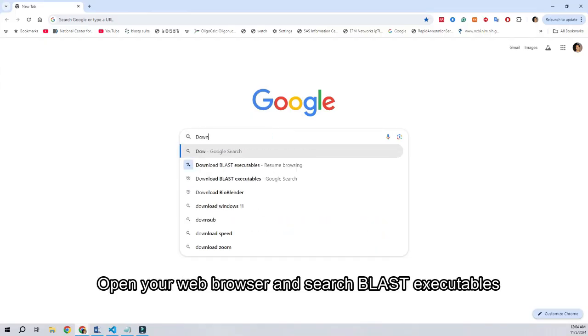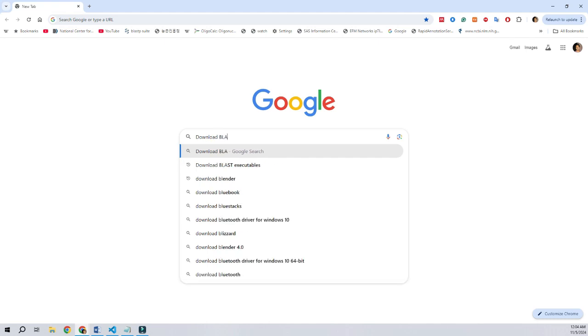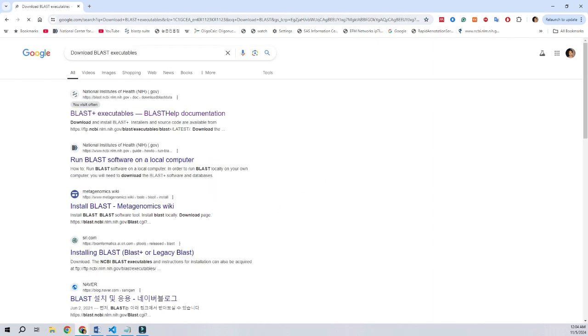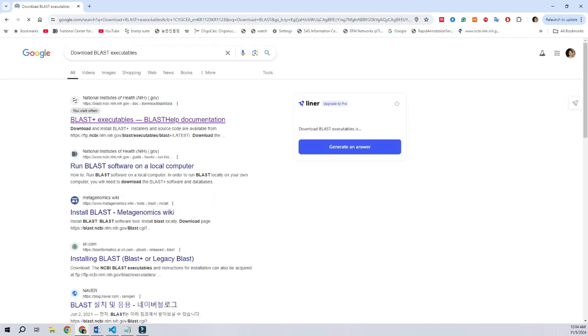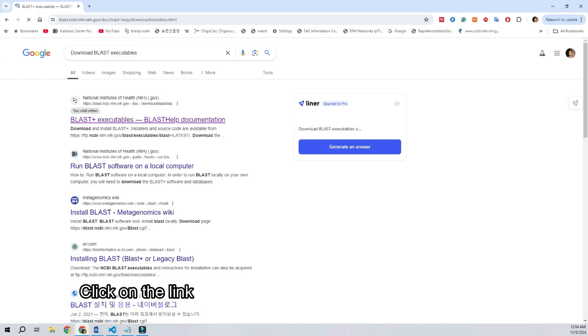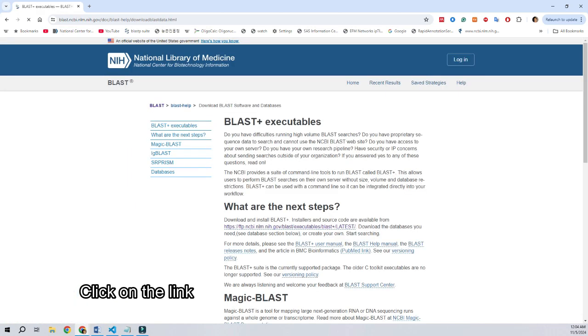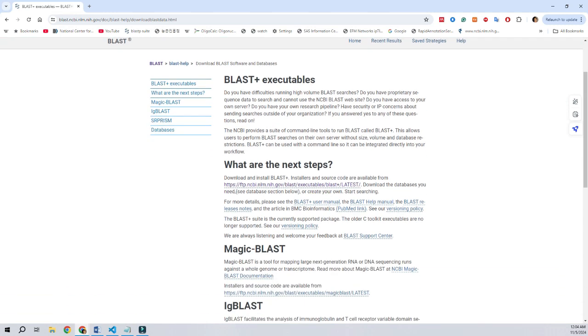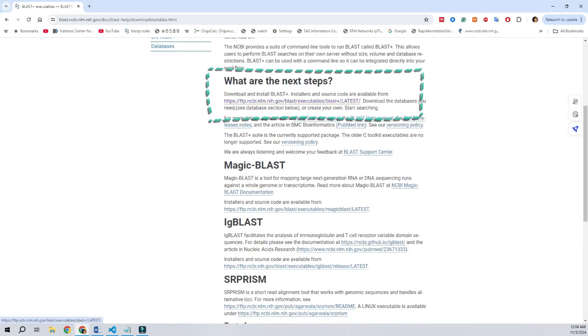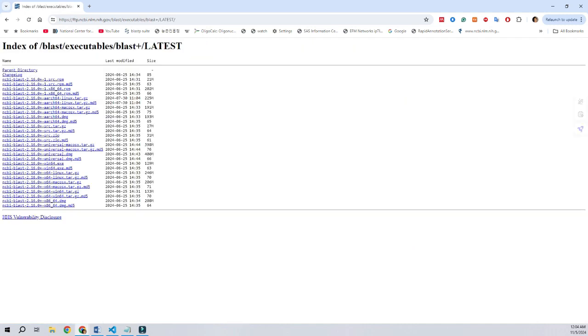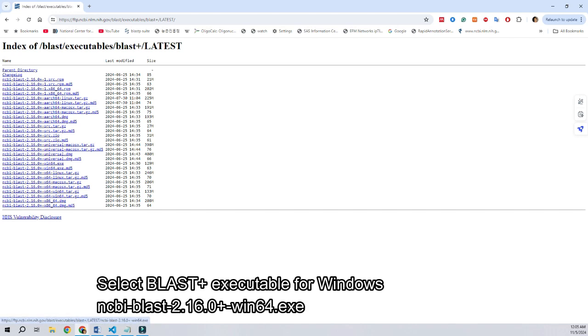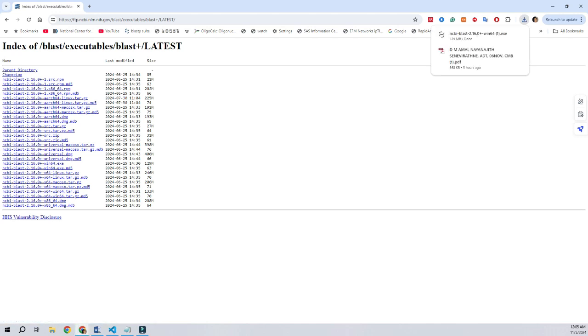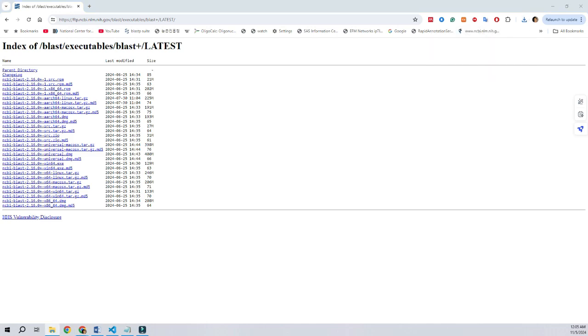Now, open your browser and search for BLAST download. Click on the link and get into the archives of BLAST executables designed for various operating systems and installation platforms. Here, I will select the BLAST executable suitable for Windows operating system. After the download is completed, just install it by following the instructions.